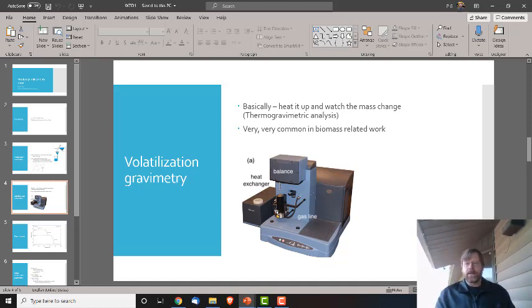You can either have nitrogen or argon, or something fairly inert, and you can see its behavior without oxygen in biomass stuff. That's usually to see how pyrolysis works with this. So you're doing things like finding out how much biochar you can produce.